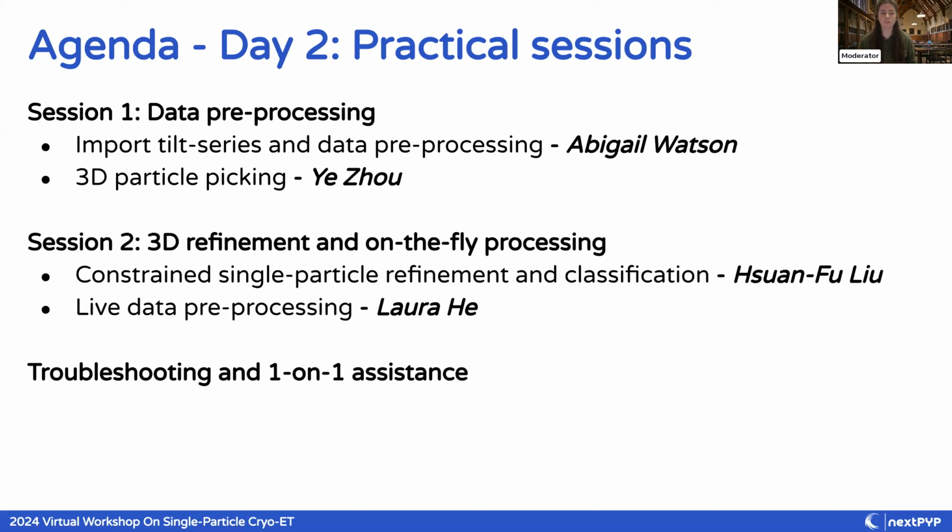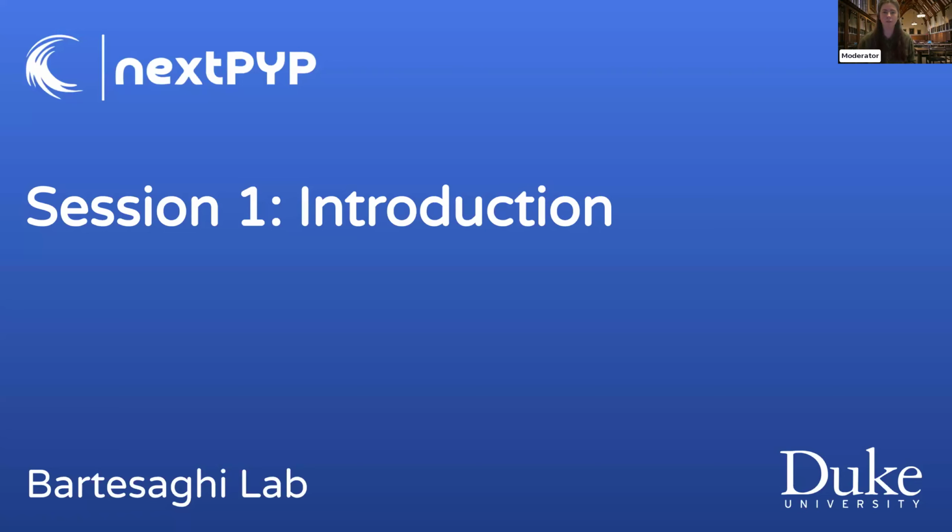After that, we're going to do session two, which will cover 3D refinement and on-the-fly processing. Shanfu will cover constrained single particle refinement and classification, and Laura will cover live data pre-processing. And then we'll conclude day two with a troubleshooting and one-on-one assistance for people using our instances. All right, and with that, we're going to start session one, the introduction to nextPYP.